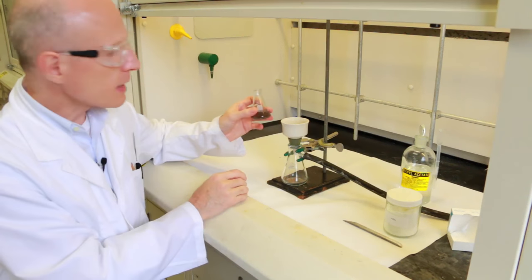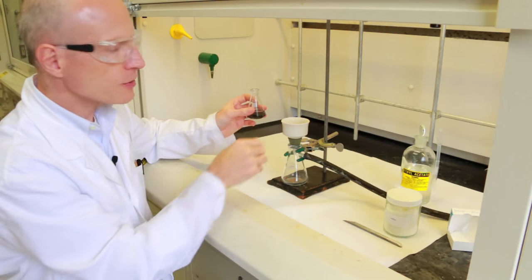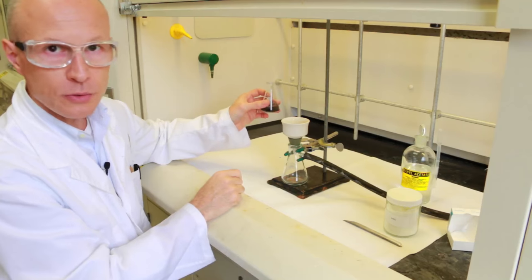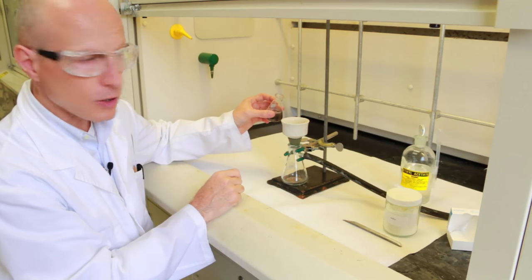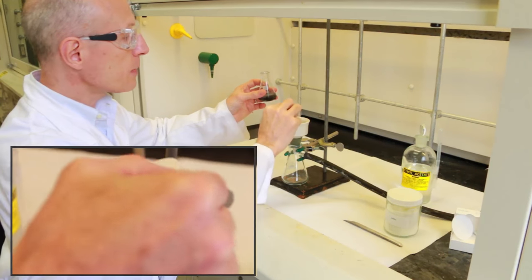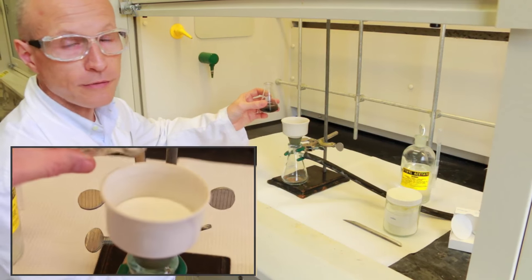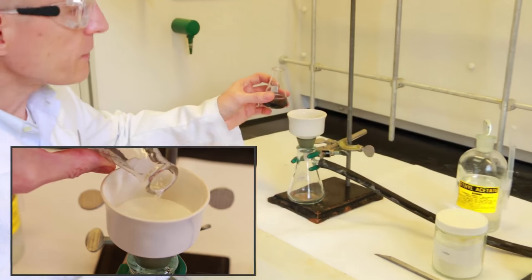When you filter through celite, it's very important not to disturb the surface of the celite, so you don't want to dig divots while you are pouring your solution. You can either pour very carefully and slowly, or you can add a second piece of filter paper on top so it will break the fall and you won't dig divots into the surface of the celite.